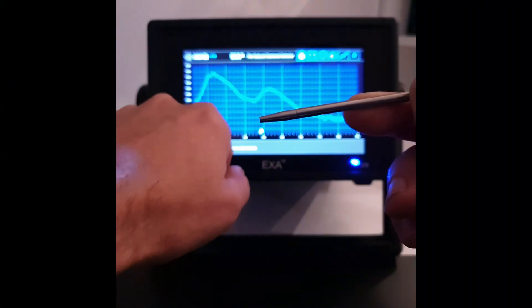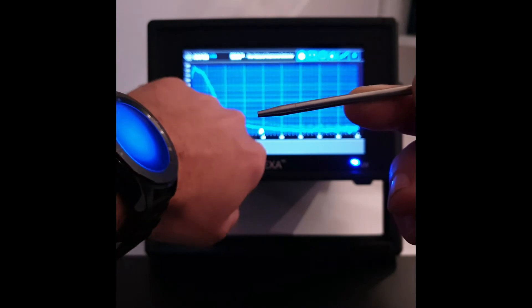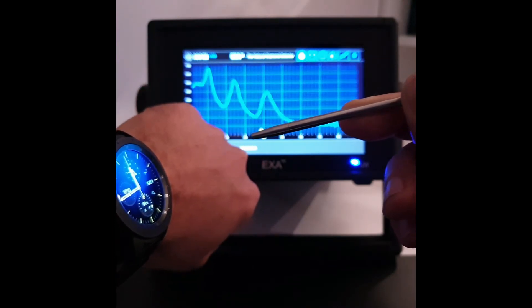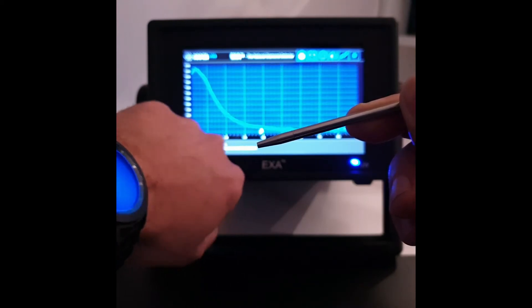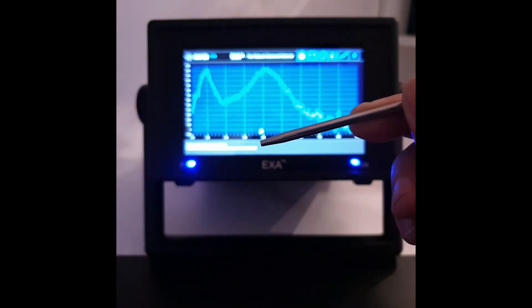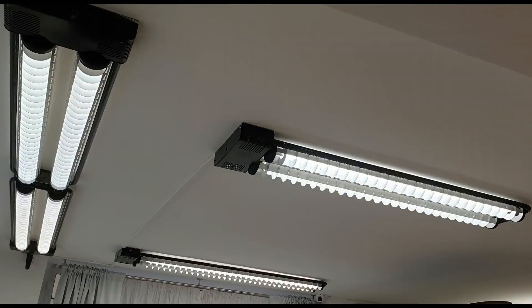The spectrometer of the EXA is very sensitive, so it is advisable to reduce the environment light as much as possible in the proximity of the testing area. In particular, the spiky light of fluorescent tubes and some LEDs can pollute the spectroscopic analysis and reduce the efficiency of the instrument.